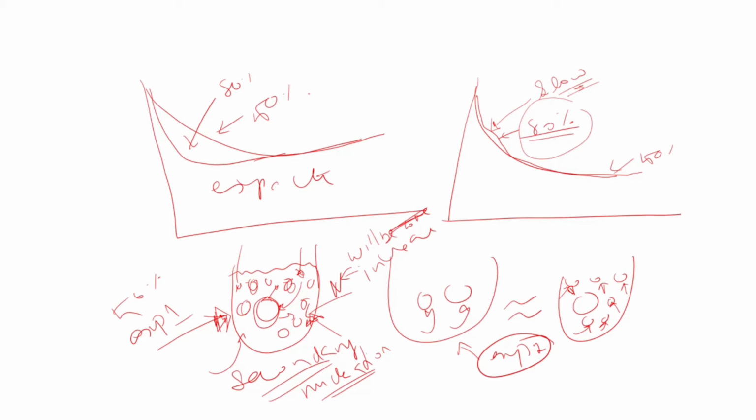At least it gives me an opportunity to explain what could have happened in the crystallizer. Crystallization is a very important process, but it also needs high skills to perform an experiment. There must be some dirt particle, that's what I expect, and that could have triggered the secondary nucleation.